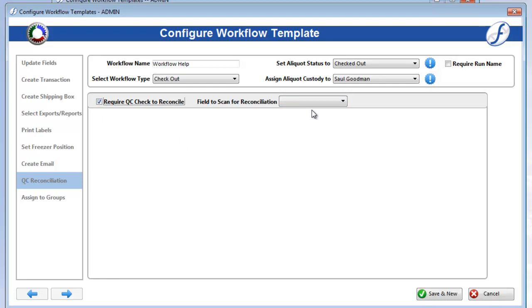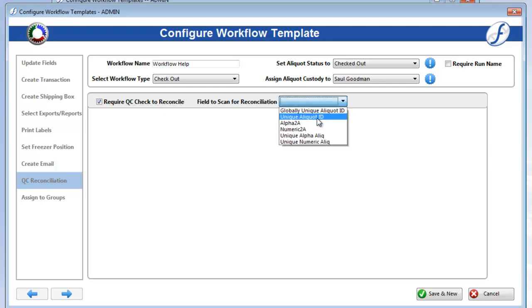You can also select a field for users to reconcile the aliquots with, but they will be able to select a different unique field as well.